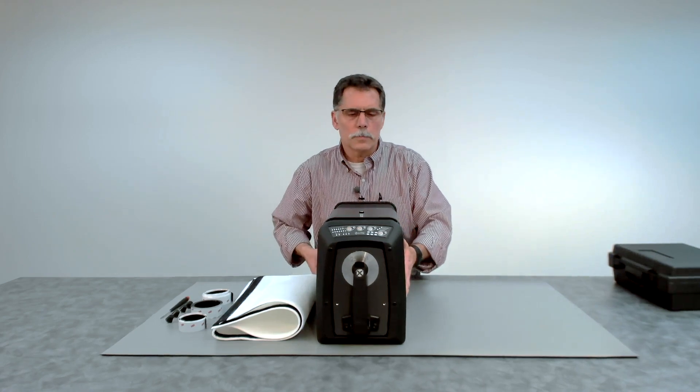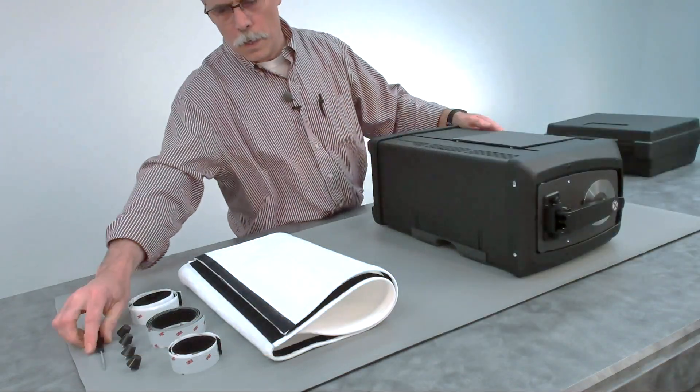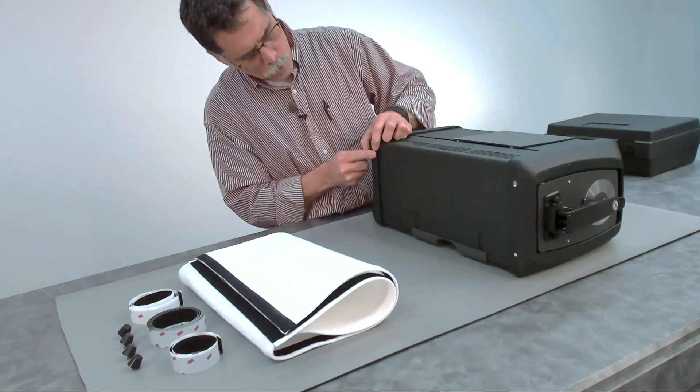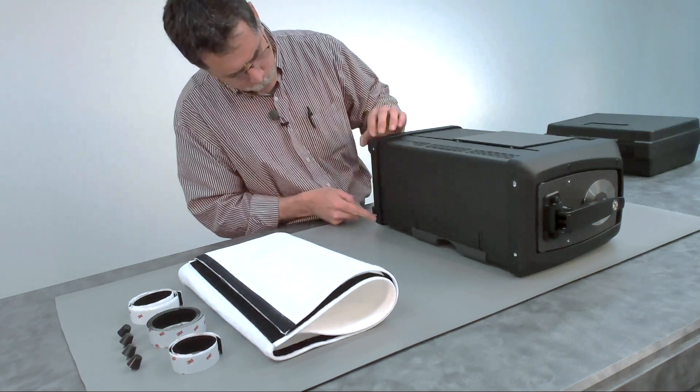The next step is to roll the instrument on its side, and you'll use a flat blade screwdriver to remove the inserts to expose the threads on the bottom.